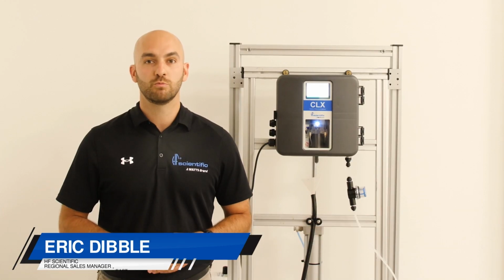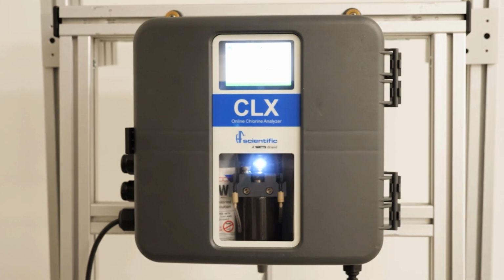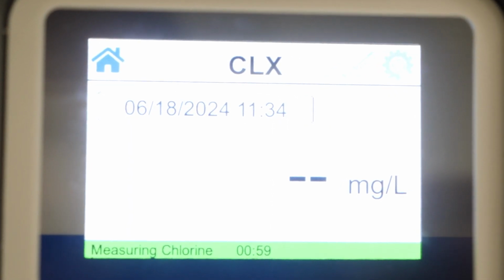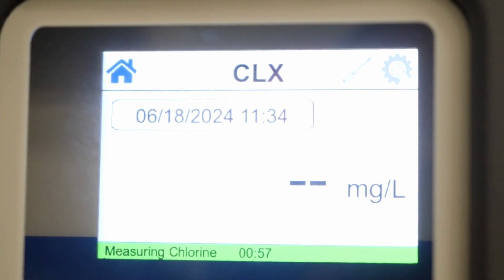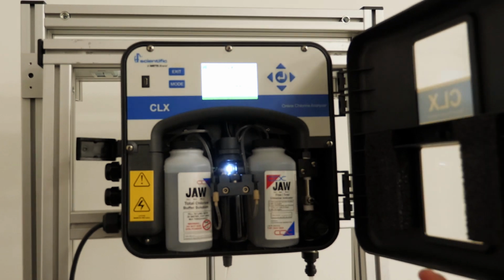In today's video, we'll be going over the new CLX Chassis update. The HF Scientific CLX Online Chlorine Analyzer recently received an upgrade to the electronics and some new capabilities. We want to take the time today to go through the new user menus and explain some of the new features on the analyzer in more detail.